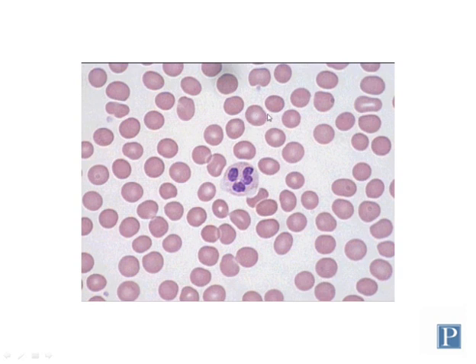You can't see a nucleus in these because these cells are anucleate, so if you're looking for a basophilic nucleus, you won't find them. In fact, the center of the cell is very thin because these cells are actually biconcave in shape, and because the center of the cell is so thin, there's very little cytoplasm to take up the eosinic stain, and so they appear very pale in the center frequently. So you should be able to see these all over the place, but the interesting things on the slide that you want to try to find are the different types of white blood cells.